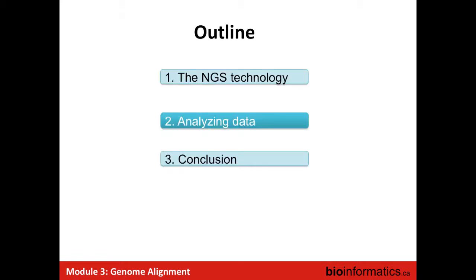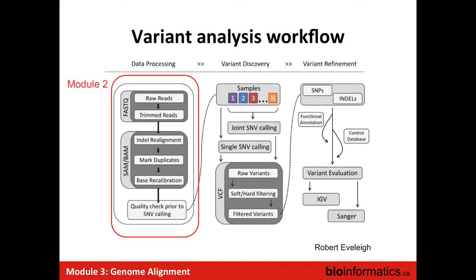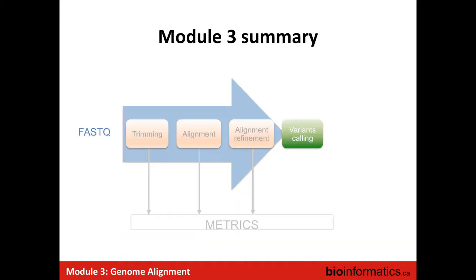Okay. So this is an introduction about the technology. Now, how can we analyze the data? In this workshop, we are working on DNA-seq analysis, so we will only focus on DNA-seq. Here I show you the workflow of the DNA-seq pipeline we have developed in our center. In this module, we will only talk about the first step, processing data to generate a high quality alignment file ready for variant calling. We will show the rest of the pipeline tomorrow.